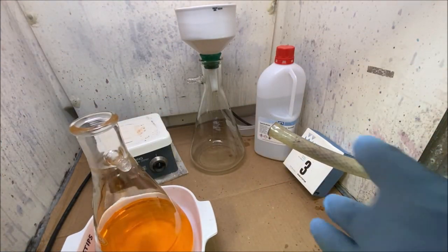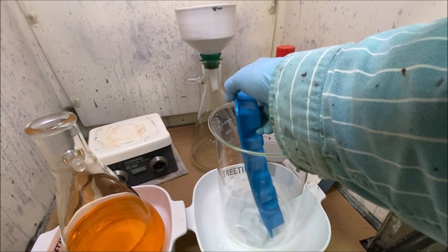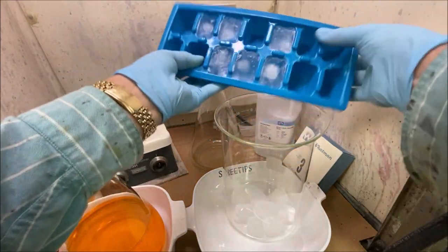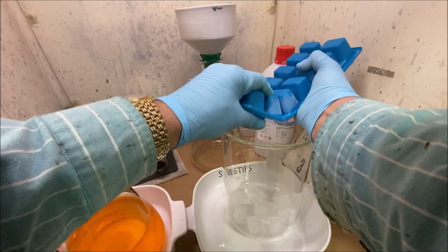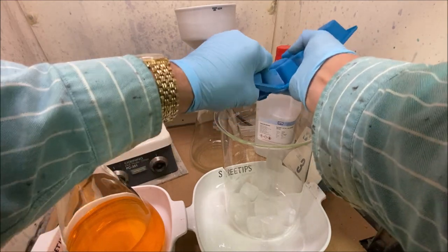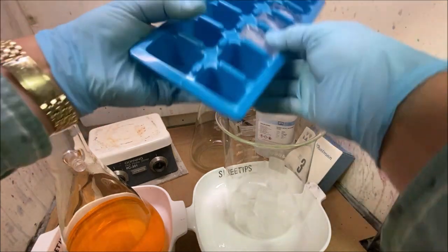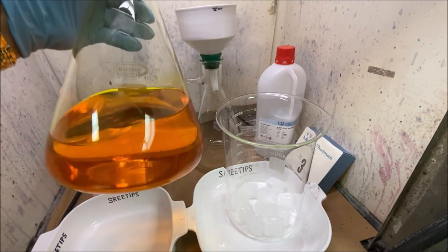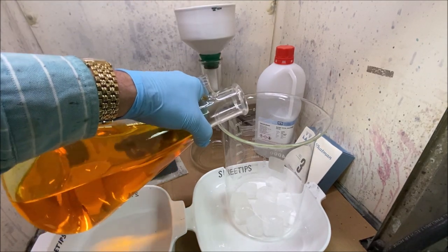Well, let's get set up to do a precipitation. I'm not taking any chances. This is almost 5 ounces of gold, and I've got some excess nitric in here, I think. So we're going to cool this down real good with some ice, and then transfer our solution into this beaker with the ice in it. You can see, second pass through the filter cleaned it up fairly nice.